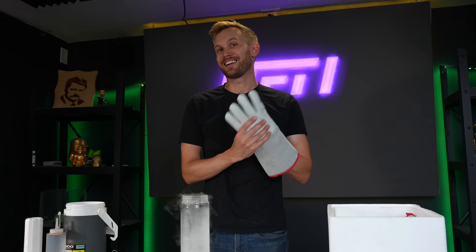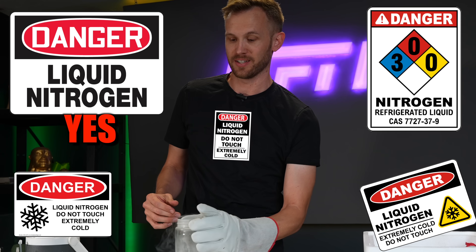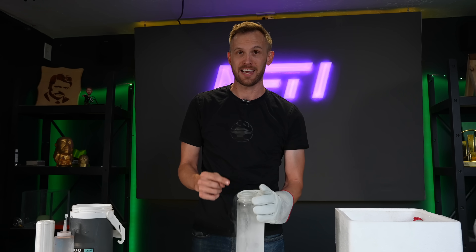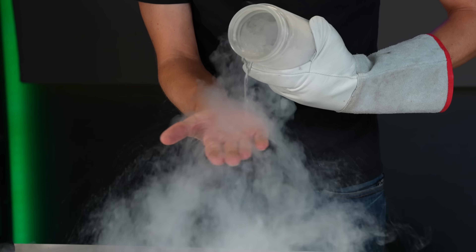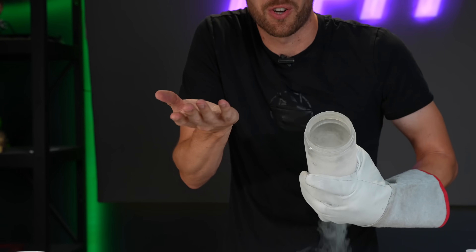People often ask: is liquid nitrogen dangerous? The answer is yes, it can be very dangerous, though it's not as dangerous as it's sometimes portrayed. I've just put on a cryogenic glove — specifically for cold stuff — and that's more for handling the containers than the liquid nitrogen itself. Because nitrogen boils so quickly, if it hits your skin it just starts boiling, and through something called the Leidenfrost effect, it creates a vapor barrier between the liquid and your skin. It feels cold for just a couple seconds and doesn't really hurt.